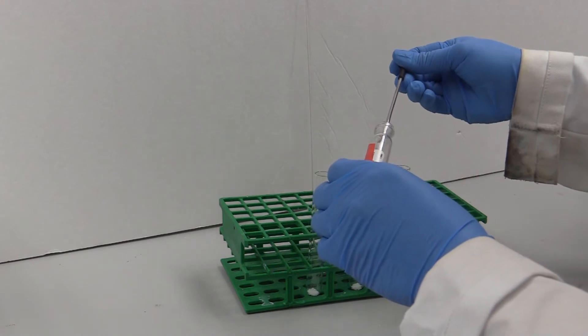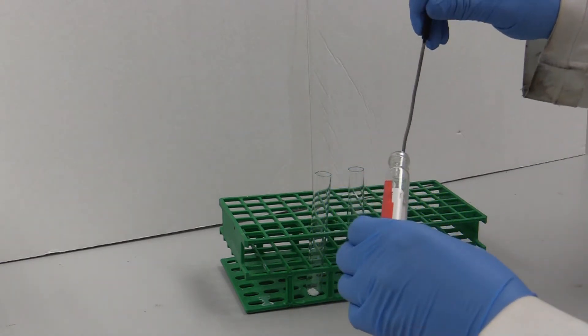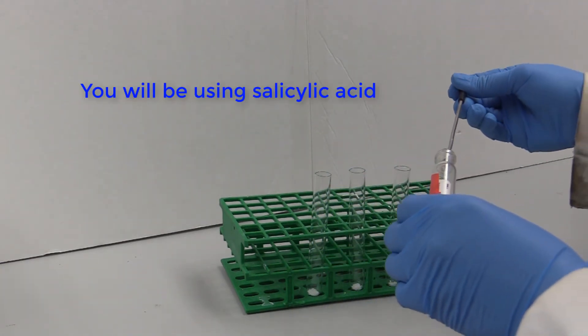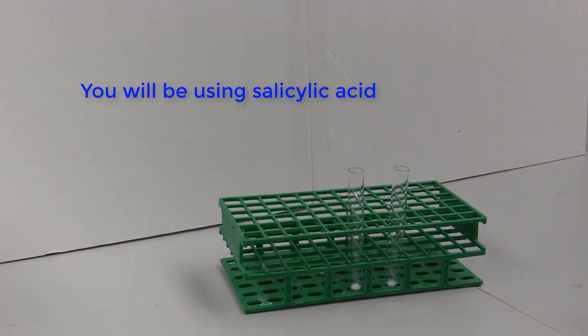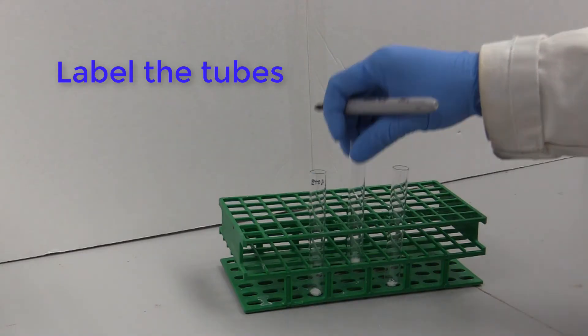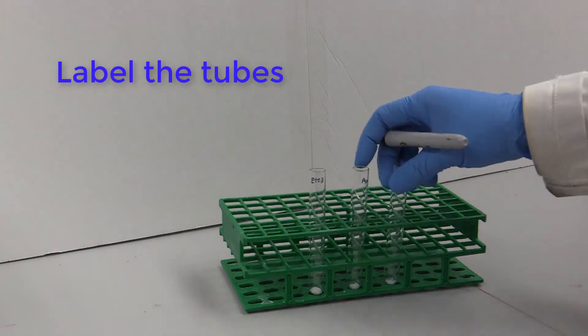When recrystallizing an unknown, add a very small amount of the unknown to a few different test tubes. Label the tubes with the solvent so they don't get mixed up later.